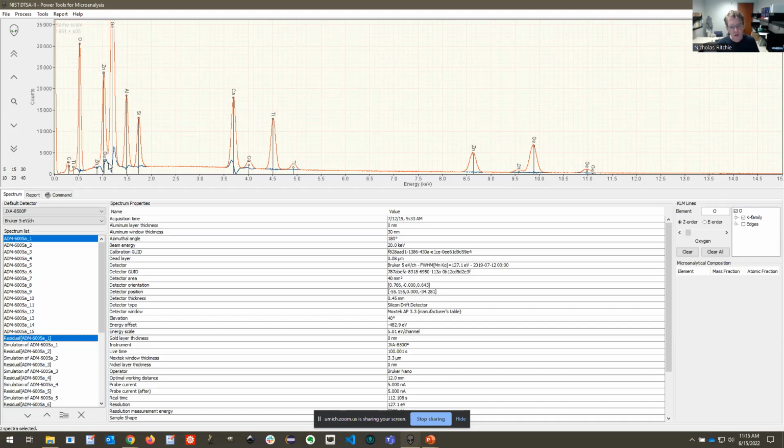These are transitions where the electron might have started in a valence shell, where chemistry actually does play a role. So that could be why we're seeing this. But generally, this looks pretty good. It looks like we haven't missed any elements in this particular quant process.